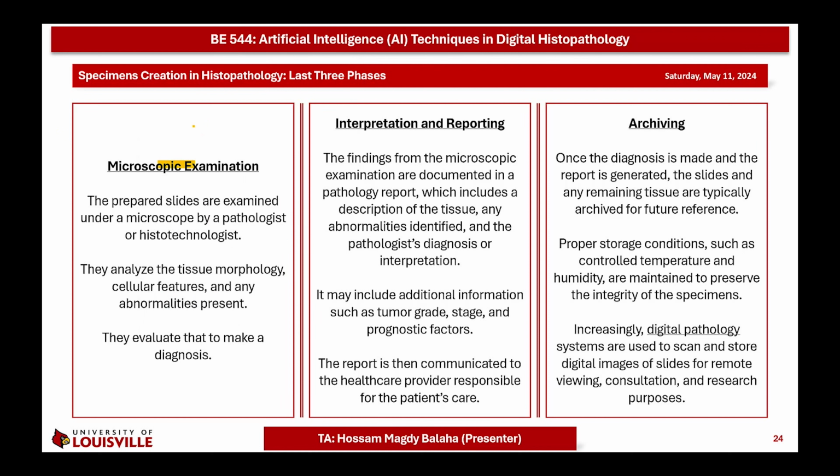The last three steps include microscopic examination. So the prepared slides are examined under a microscope by a pathologist or histotechnologist. They analyze the tissue morphology, cellular features, and any abnormalities present in the specimens. They then evaluate and make a diagnosis. Next, they make interpretation and reporting.